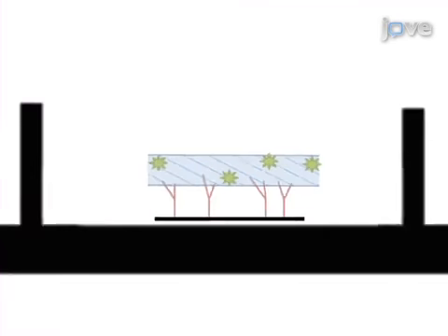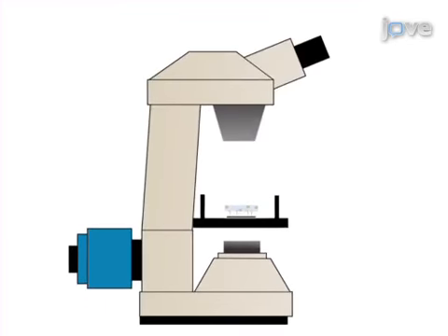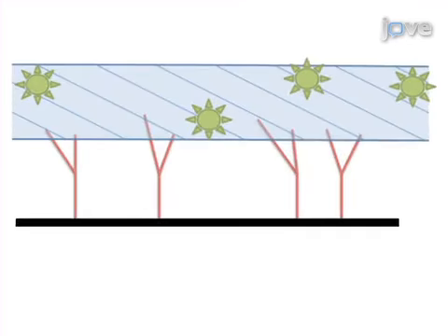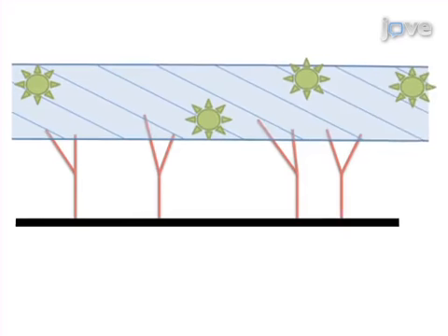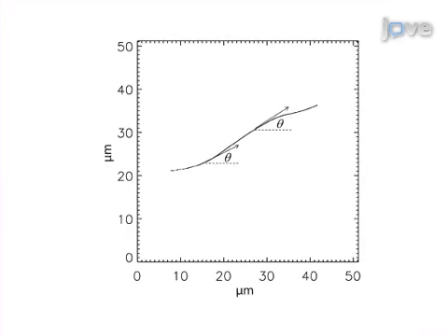Next, videos of gliding microtubules are collected using fluorescence microscopy. The final step is analyzing the gliding assay videos to calculate the microtubule flexural rigidity. Ultimately, the gliding assays are used to determine the flexural rigidity of single microtubules.